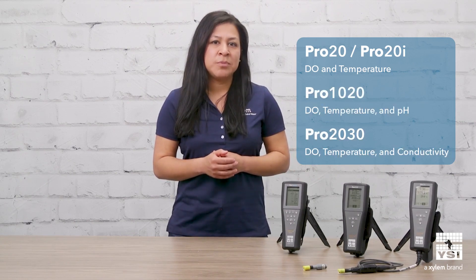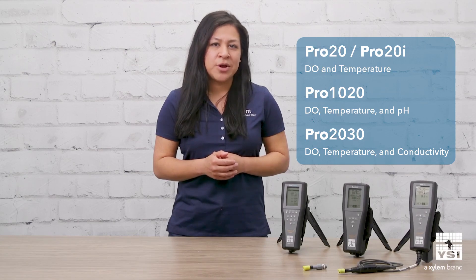Both galvanic and polarographic sensors can be used on all of the ProBasic DO instruments, which include the Pro20, the Pro20i, the Pro1020, and the Pro2030. ProBasics cannot connect to a computer or use optical based technology.